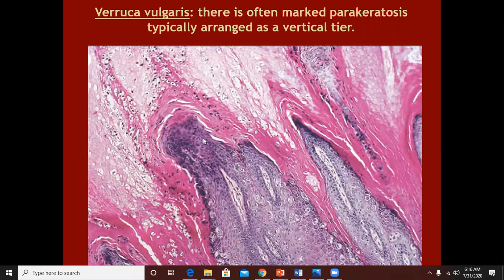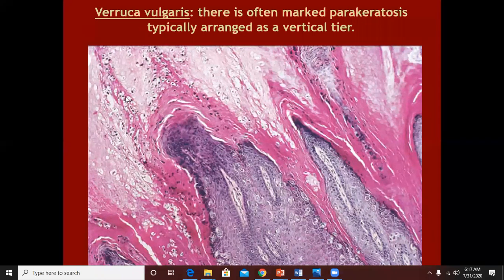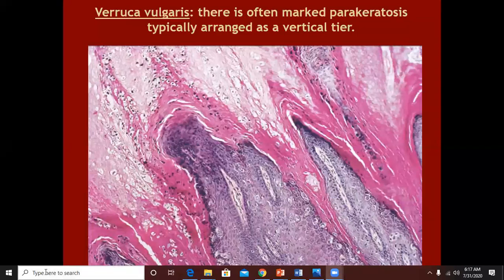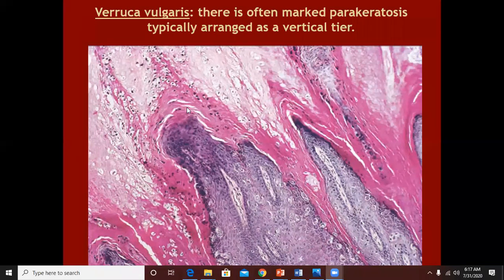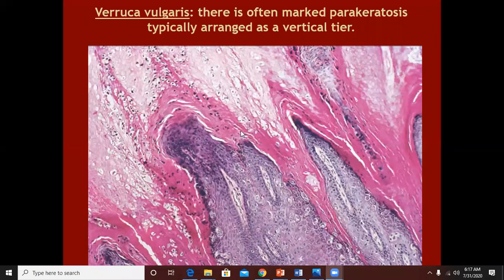Usually, along the projections of these papillae, superior to the projection, you will see thick tiers of parakeratosis as well. But these parakeratotic columns are well insulated within the thick hyperkeratosis. So parakeratosis will be just superior to the papillomatosis but not exposed to the surface. The parakeratotic columns will be less prominent in the concavities of the papillomatosis.